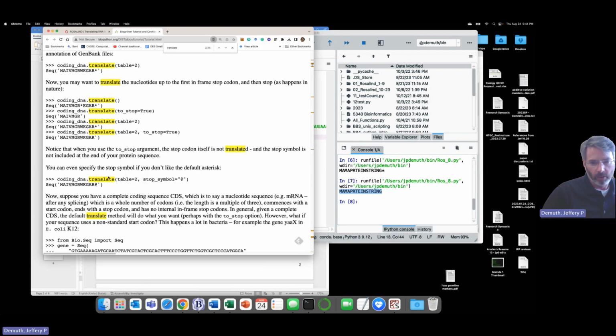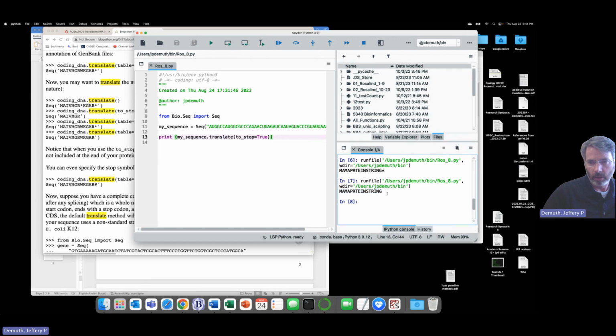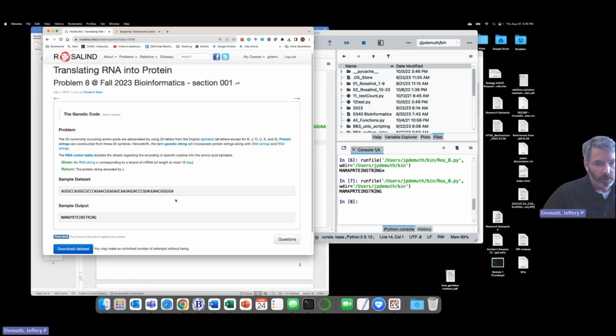Python wants. Now, of course, the quick and dirtier way would be, when you get your output, just delete the asterisk. But this is the more appropriate, more universal way. Doing it this way will work all the time, especially if you had this in a pipeline or something.